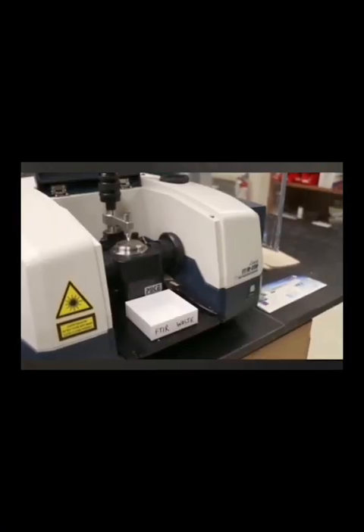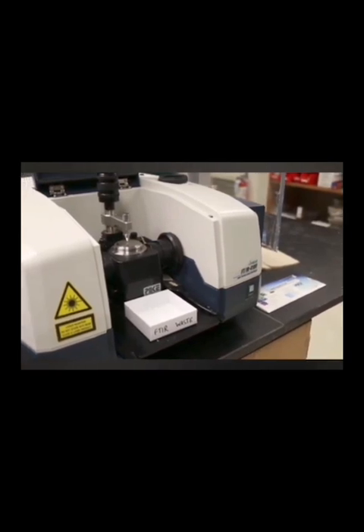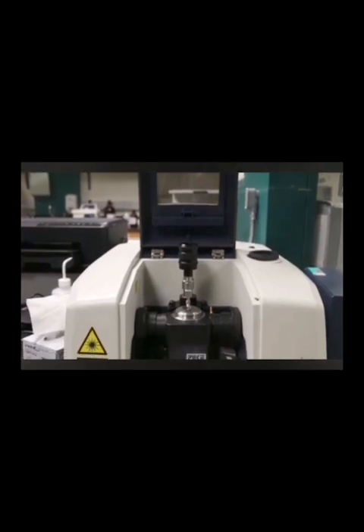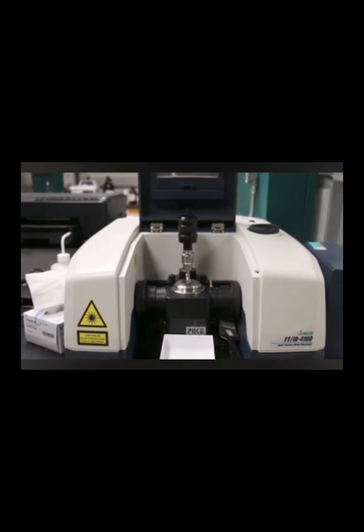Fourier transform infrared spectroscopy, also known as FTIR analysis or FTIR spectroscopy, is an analytical technique used to identify organic, polymeric, and in some cases inorganic material. The FTIR analysis method uses infrared light to scan test samples and observe chemical properties.